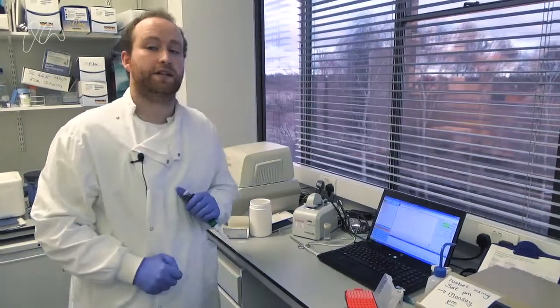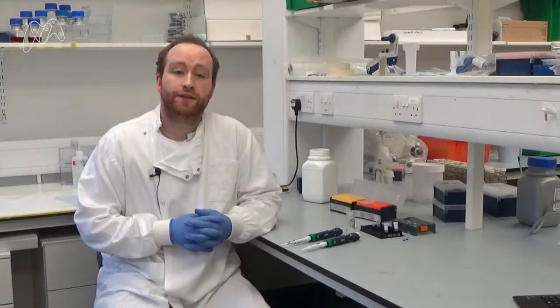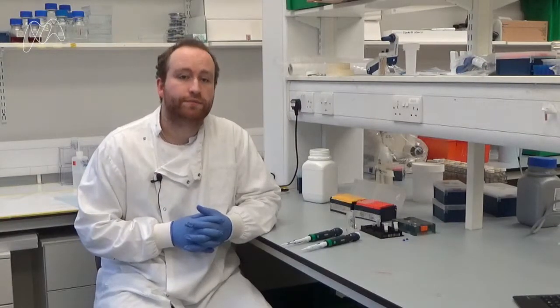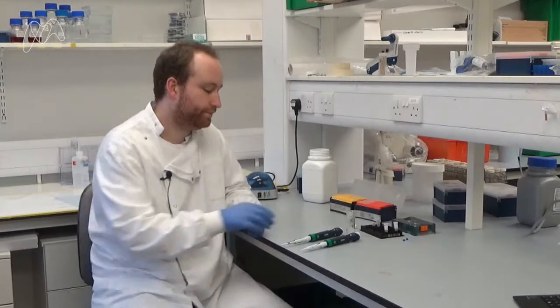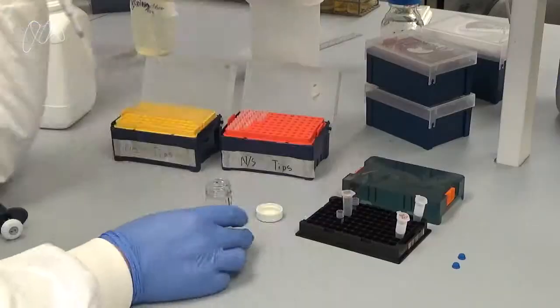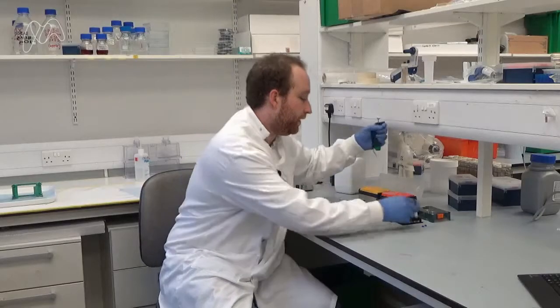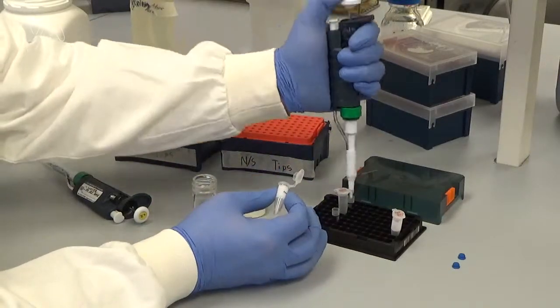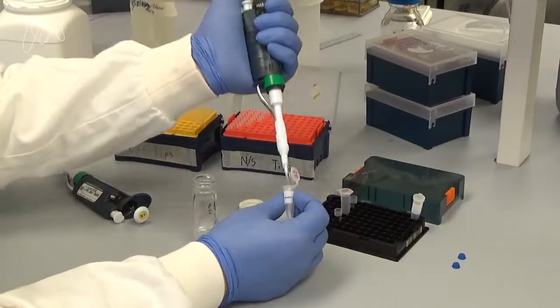The machine has now given us a reading, which we can use to prepare our sample for sequencing. For each sample, we have two tubes. This is because DNA is made of two strands that are sequenced separately. To each tube, we add water, our primers, and our sample.